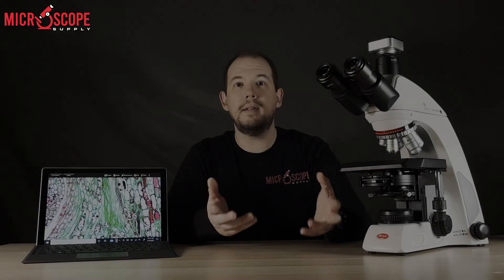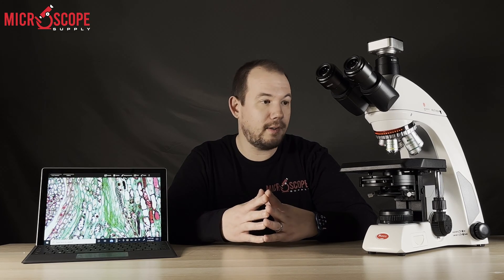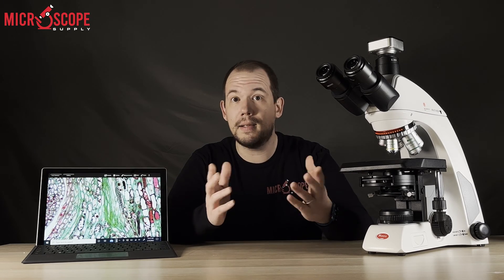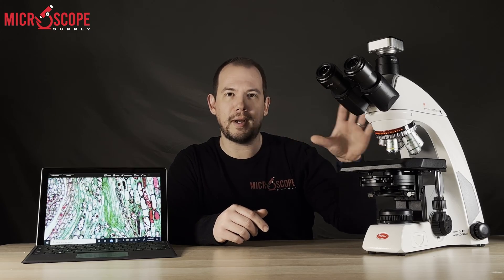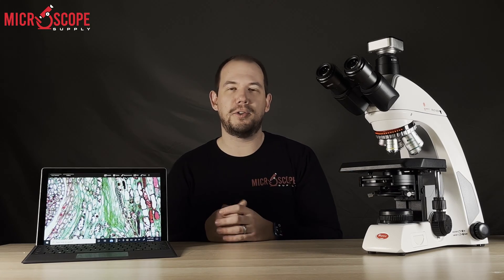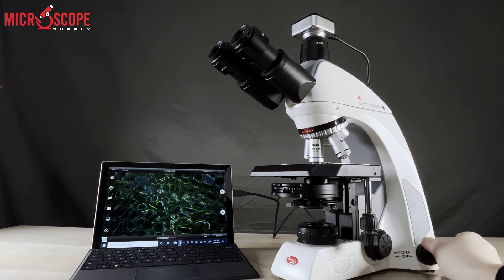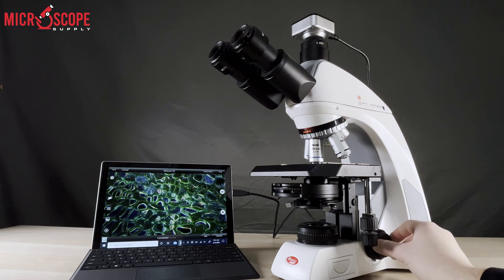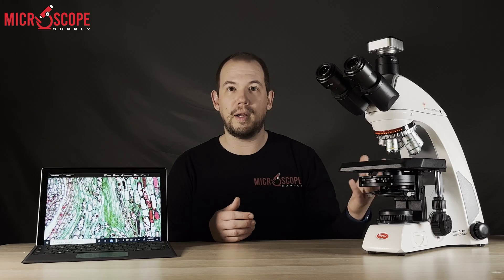The C2 is also available with a simple polarizer and analyzer, which are fairly inexpensive compared to other makes and models on the market, as well as an intermediate fluorescence attachment. The Motic Pantera C2 is a great option for a college or university looking for a more advanced microscope in a laboratory setting. If you want to purchase a microscope but may want to add phase, dark field, or fluorescence in the future, the C2 is going to be a great choice.